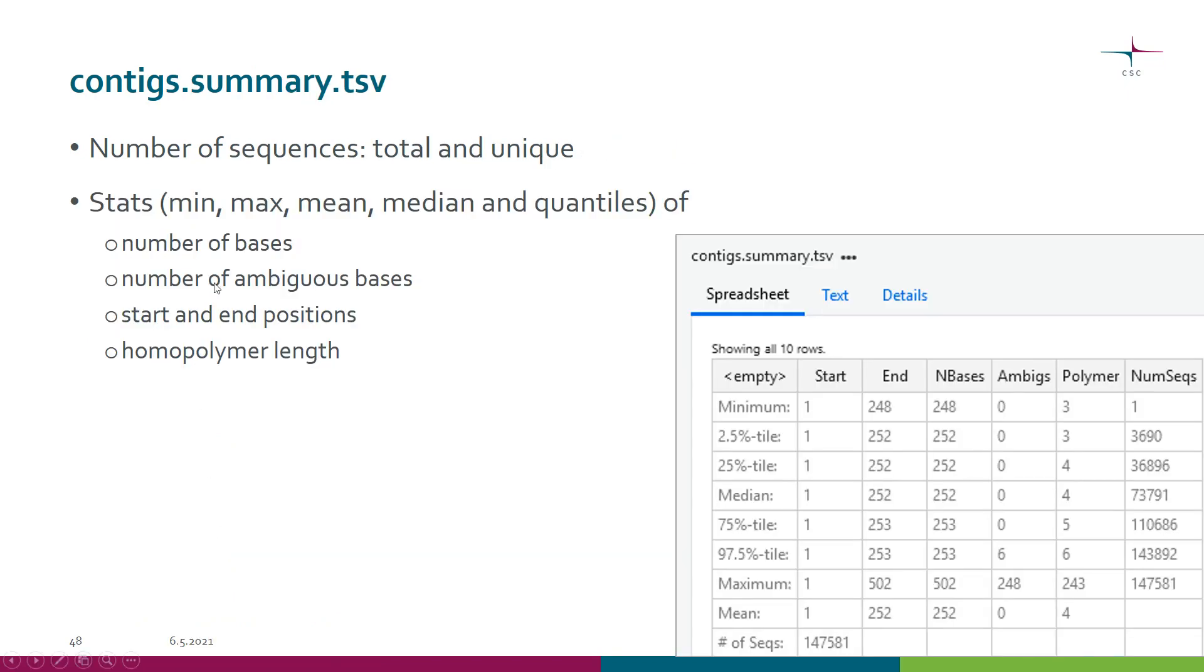Finally there is a summary file. Many of the analysis steps actually produce a summary file. Here first of all you will see the number of sequences.